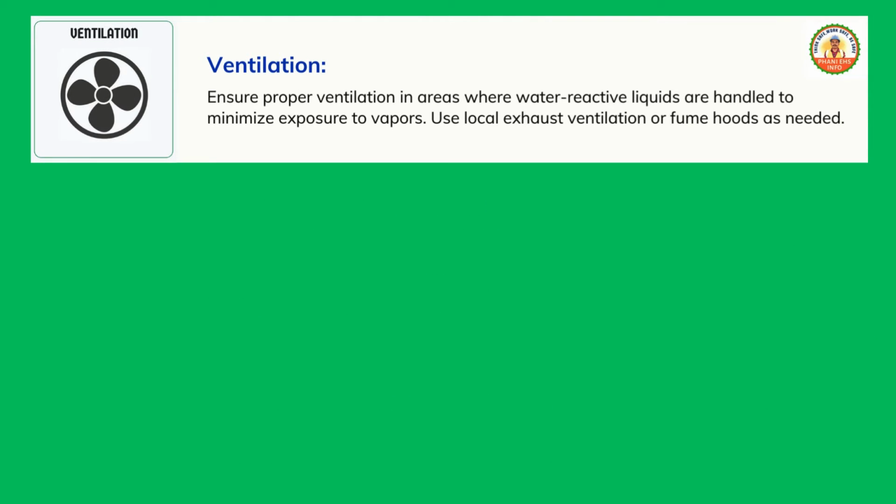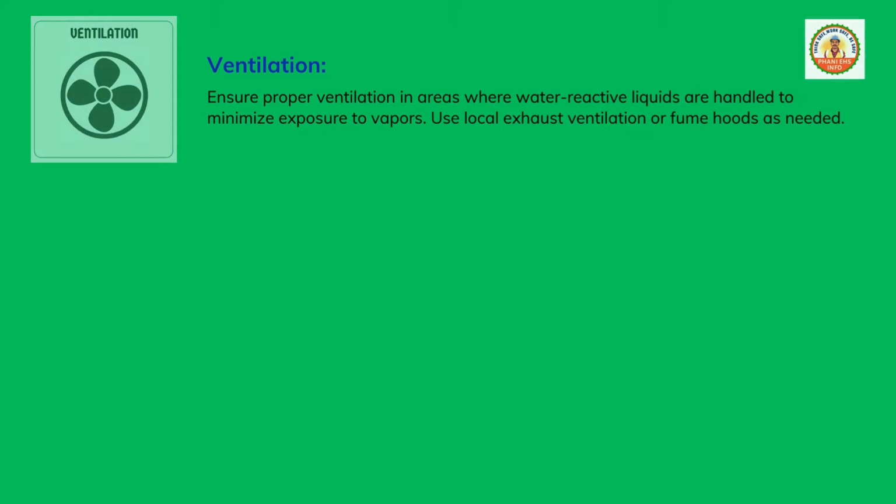Ventilation. Ensure proper ventilation in areas where water-reactive liquids are handled to minimize exposure to vapors. Use local exhaust ventilation or fume hoods as needed.